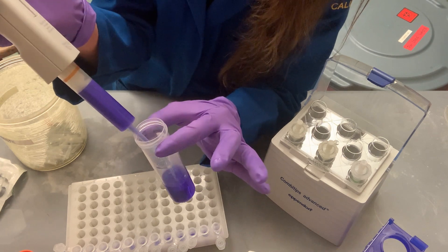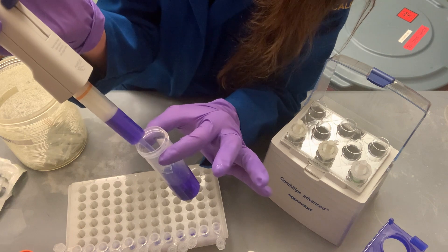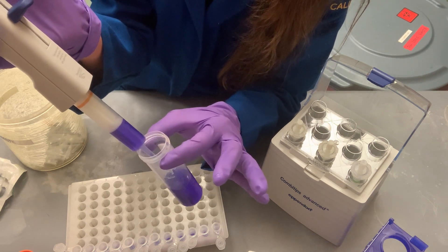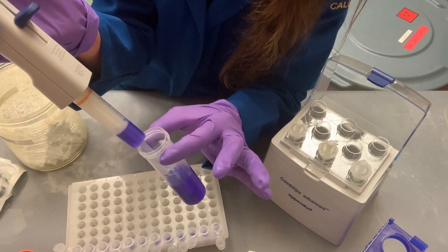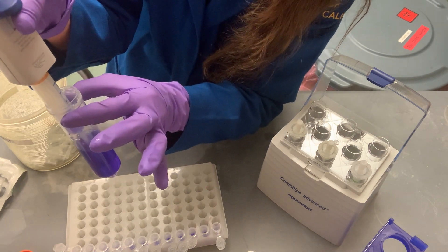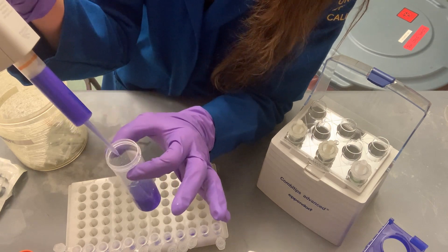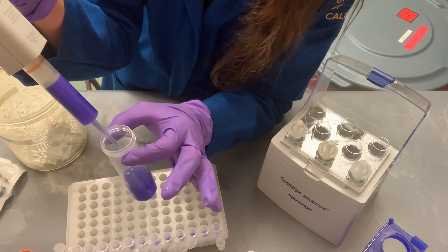You can always refill mid-way. Snap down the bottom lever and pull more liquid up. Don't trust that first dispense after refilling. With a 10 mL tip set to 500 µL, you can make 20 aliquots per fill — but if you need more, just refill it and continue.